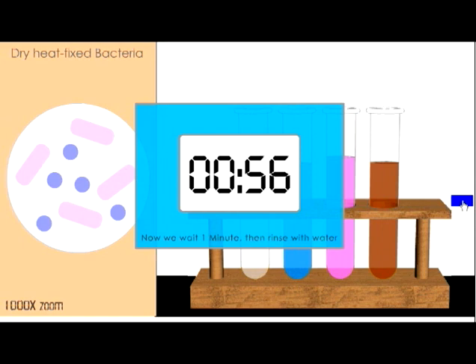So we can see that after the final step, some of the bacteria are stained pink, while the other bacteria are stained purple.